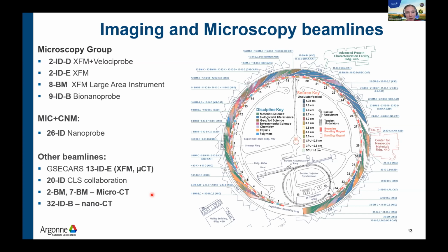And here's an example of one of the science cases we had from this beamline, where we were studying mineral depositions in the layers of the beluga whale tooth.